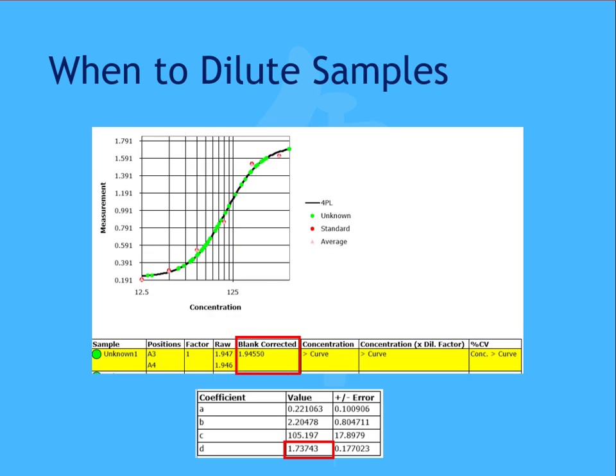For samples with results that cannot be calculated, these have y-axis results, in this case blank corrected, outside the asymptotes of the curve. This example uses a 4PL curve, a commonly used fit method in biological assays. Other curve methods may be in use, but we'll discuss the 4PL curve fit as it's widely used in ELISAs. For a 4PL fit, the y values of the asymptotes of the curve are represented by the A and D parameters. So for this example, you can see the blank corrected value for unknown one is 1.94550, and this is greater than the D parameter 1.73743.